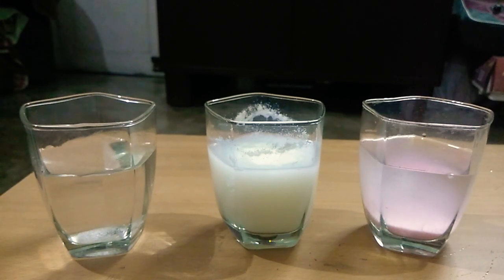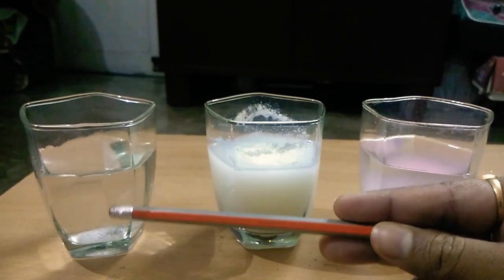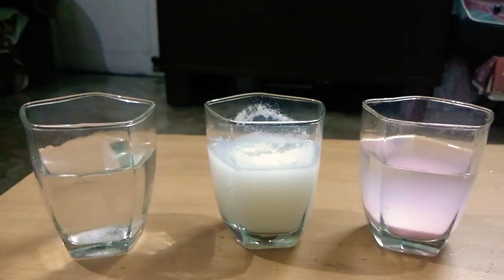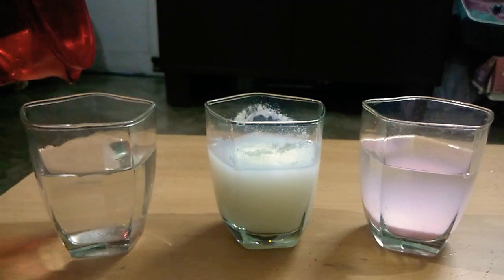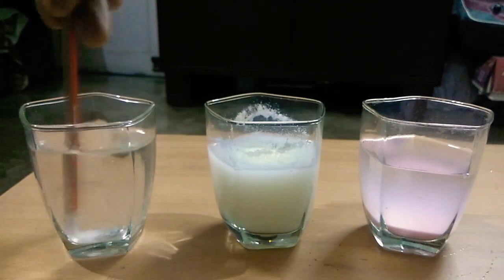So the first difference: what are the comparative properties that we'll study? First is whether it is homogeneous or heterogeneous. Now this is a solution. Let me dissolve the whole sugar, then the concept will be clear to you.